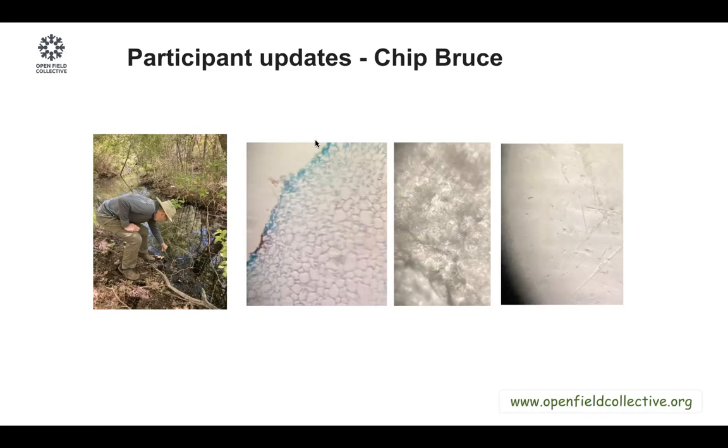Yeah, sometimes, when you have microscopic algae, they can get lost in your sample, and you have to find a way to, or maybe try to scrape some algae and try to do microscopy with them. Some of the algae you can see physically attached to a stone or somewhere there. You can scrape them up and try to make a sample out of it. This is just practice. So try to see if you can make good samples out of those algae that are definitely attached to a stone and all that.